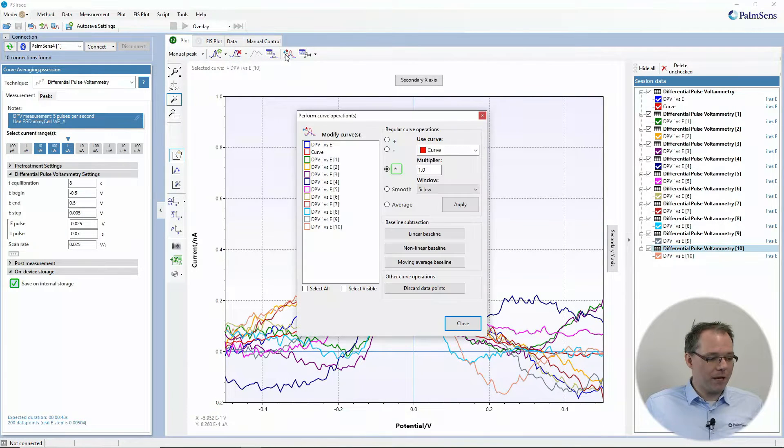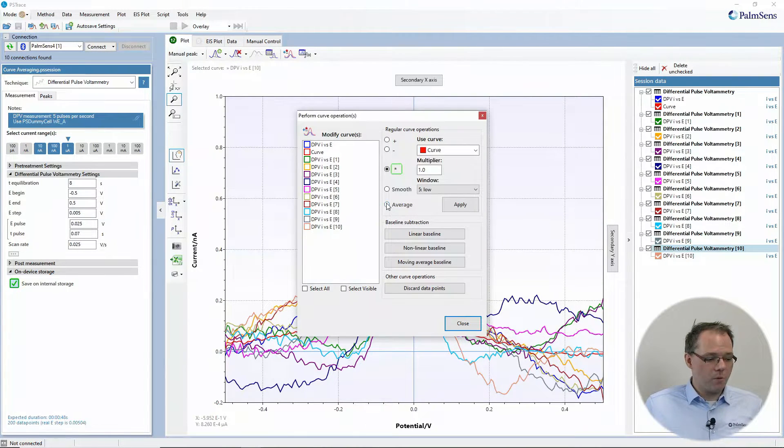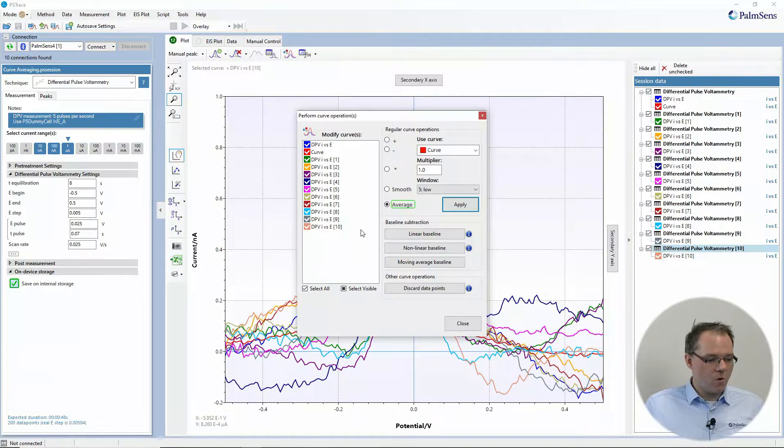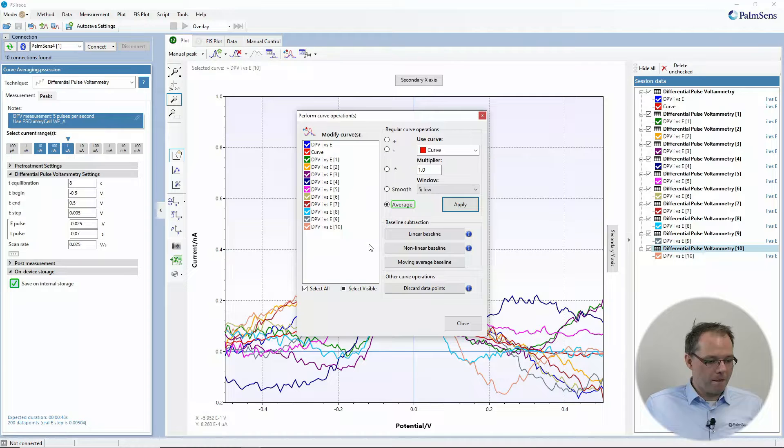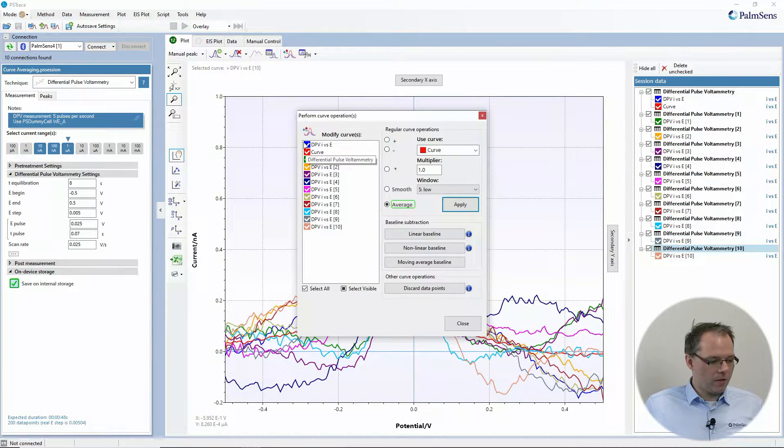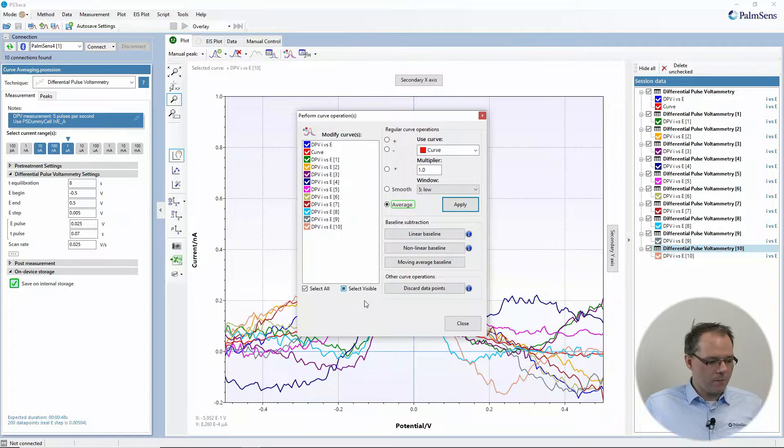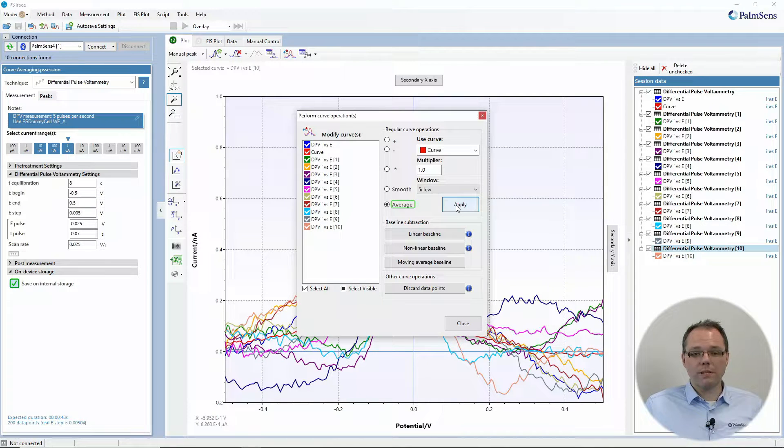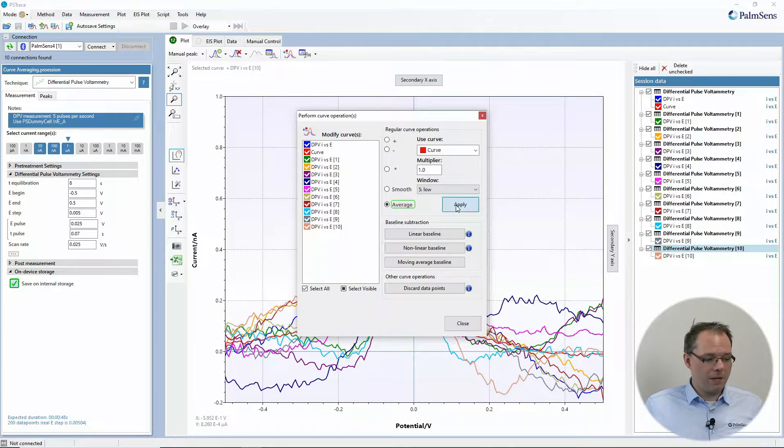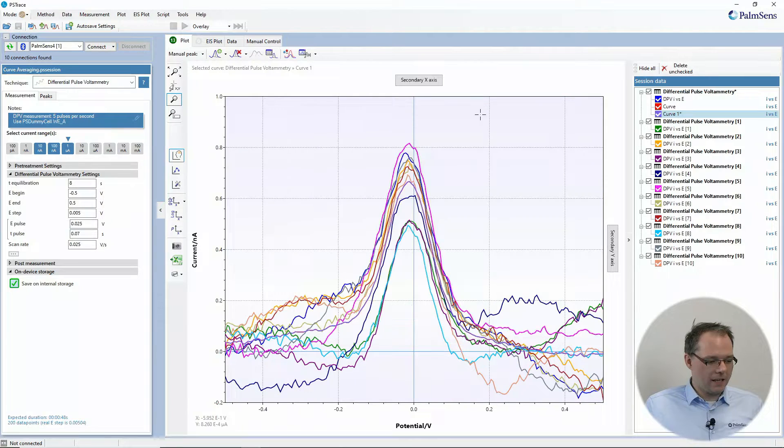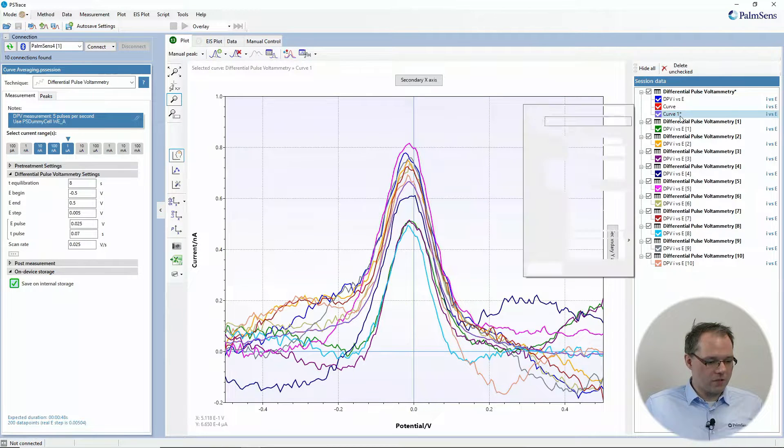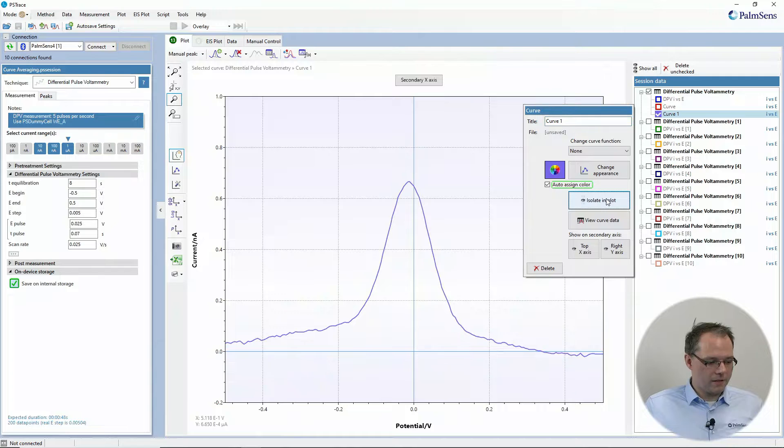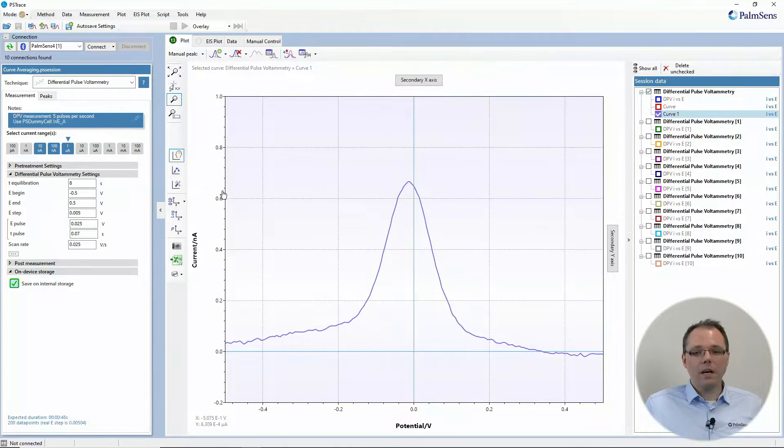So again, we go back to the curve operations. We choose to average and we just select all of these curves. And then we want to average these. So for that, I just need to press then apply. And I get an averaged curve, which is this new curve that appeared. So isolated in plot.